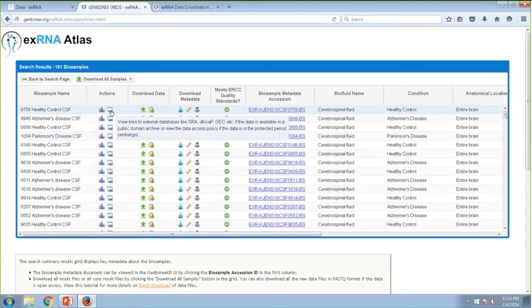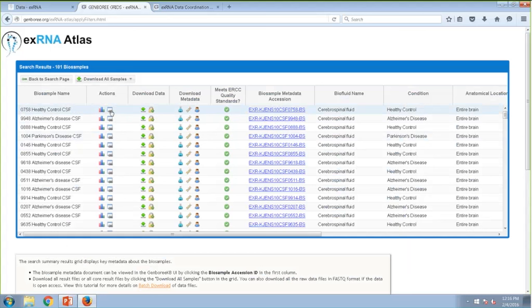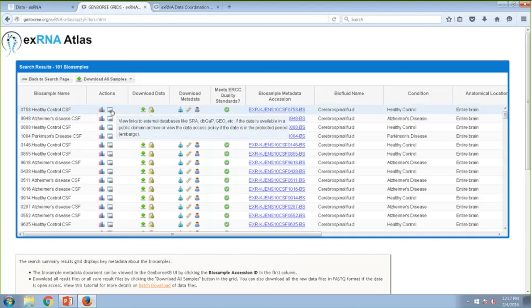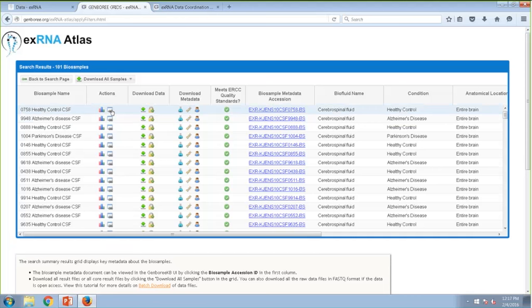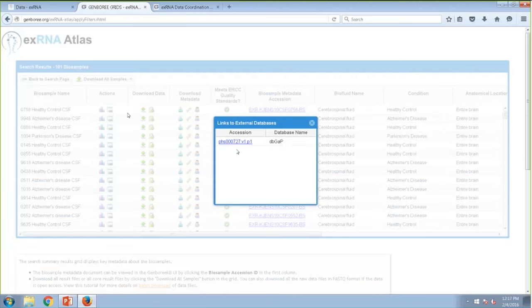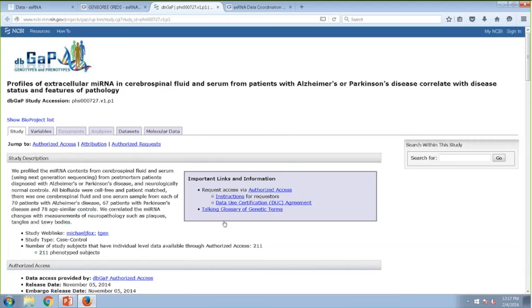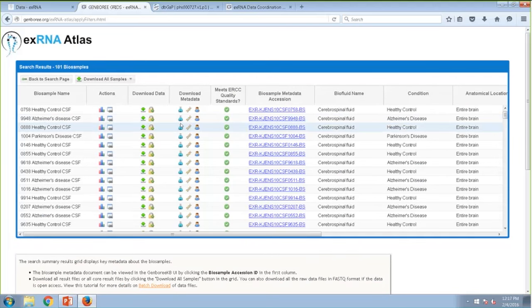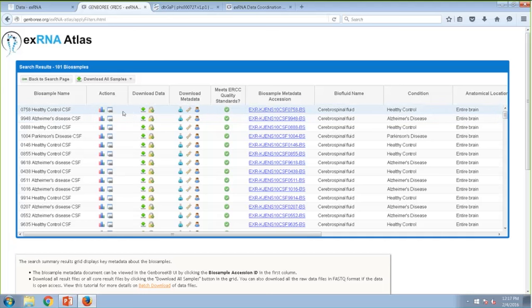The next icon is a link to external databases. If a particular sample has been deposited in a public domain archive like SRA, dbGaP, or GEO, you'll see the links here. Clicking it shows a dbGaP ID, which takes you to the dbGaP study. Since dbGaP is a controlled-access database, we cannot provide raw data files directly from the Atlas — you have to request the raw data files through dbGaP itself. For SRA or GEO IDs, you can download raw data files directly from those links.